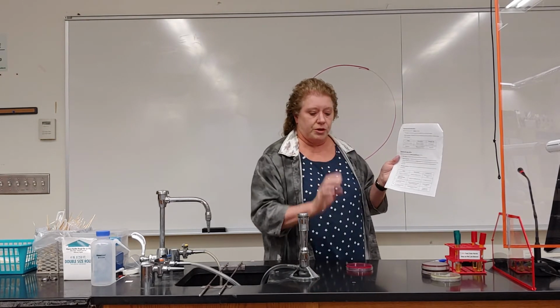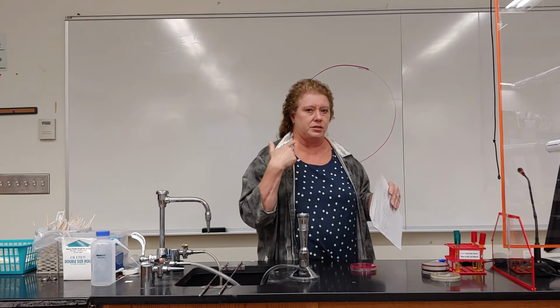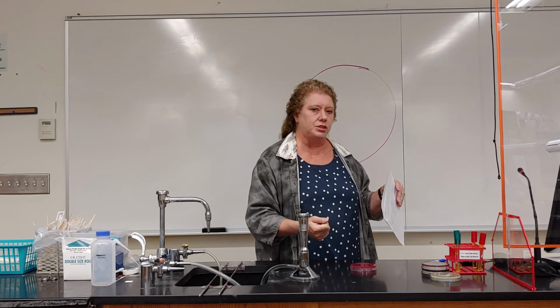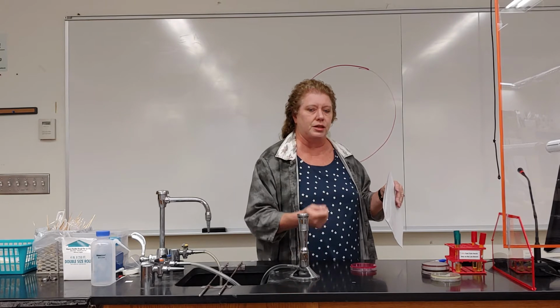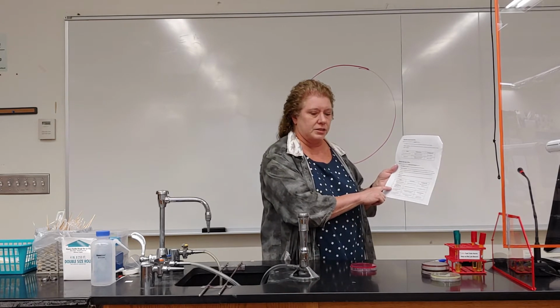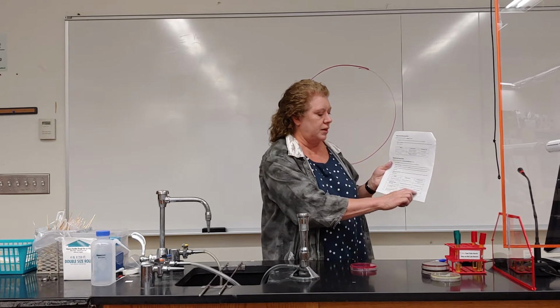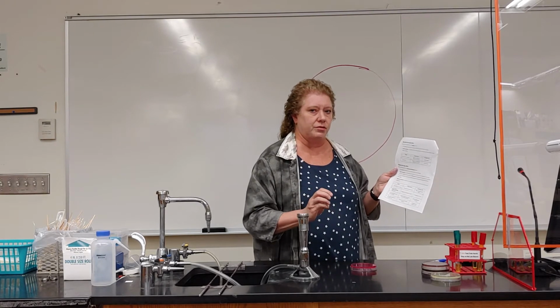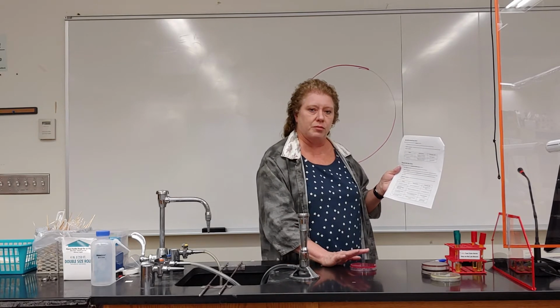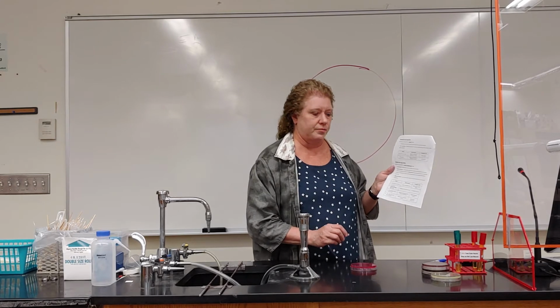So when you have growth on it, remember, you can tell it's not inhibited by NaCl, you can tell that it's a Staphylococcus species, and then from there you can tell additional information because of the differential ingredient, phenol red. You can tell if it is producing acid from mannitol fermentation by the media turning yellow, and that will tell you it's a possible pathogenic Staphylococcus aureus, or it can tell you that it cannot ferment mannitol because the media remains red, and that will tell you that it is a non-pathogenic Staphylococcus.